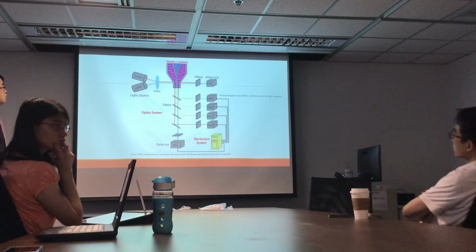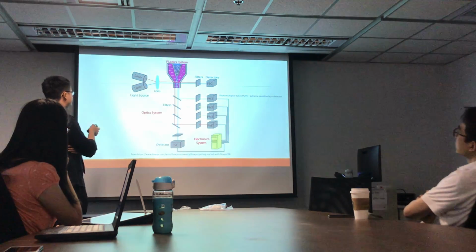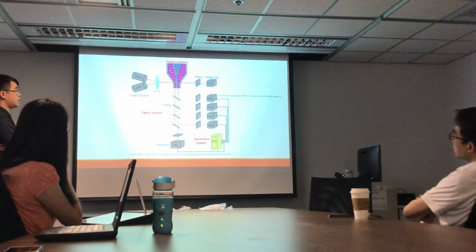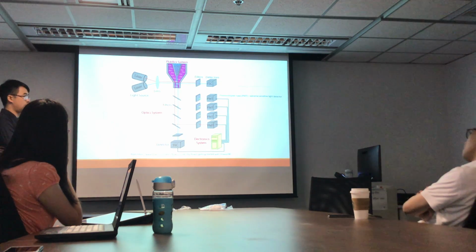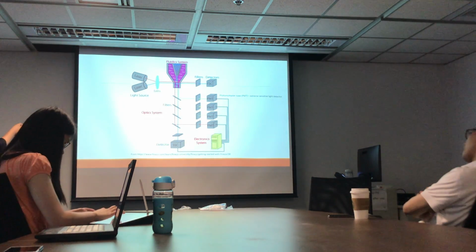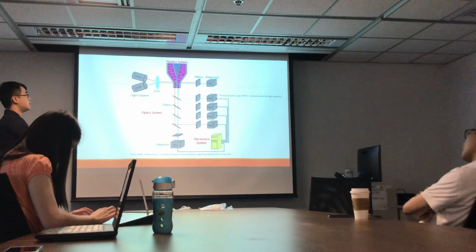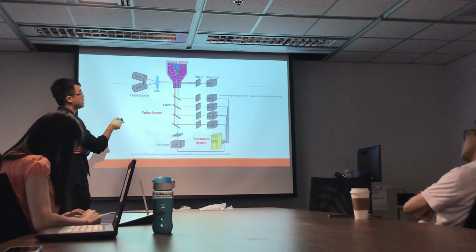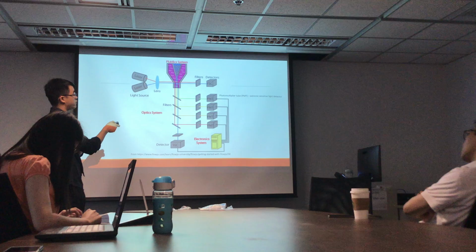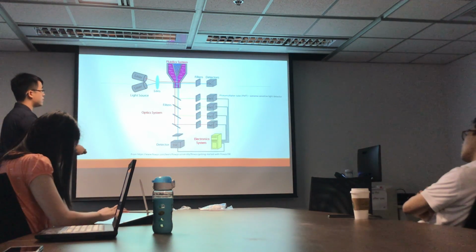Now we have another diagram demonstrating the setup of a flow cytometer. You don't have to know the details. What you need to know is that we have a light source here. In our case, we don't necessarily have only one laser beam. We usually have two to three laser beams of different wavelengths that shine and hit the cell here. And again, FSC simply means forward scattering, so this is the detector for forward scattering. And here we have the detector for side scattering.